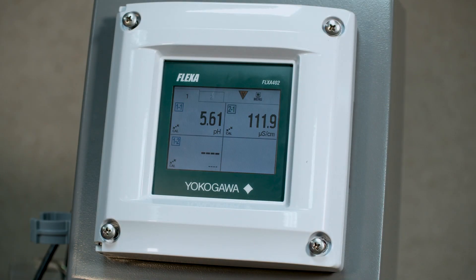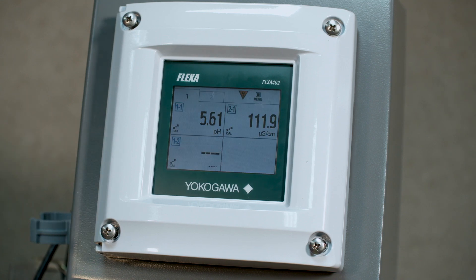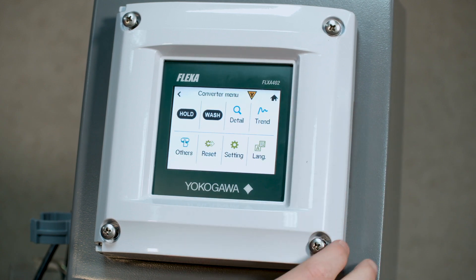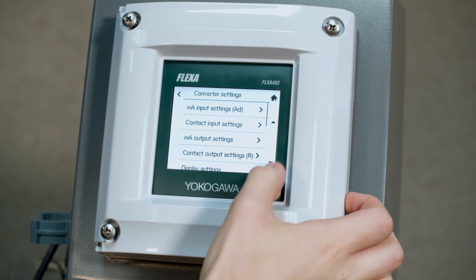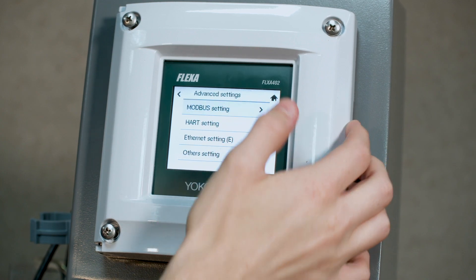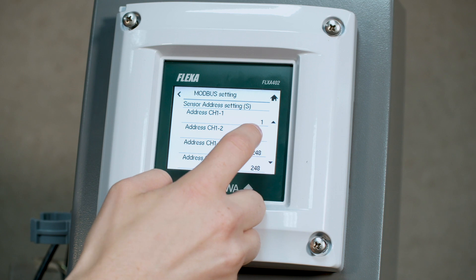Now that we have set our Modbus address to 2 for the SA11, we will plug the sensor back in. You'll notice even if you wait for a little while you will still get four dashes, because you need to go through and change a couple more settings in order to read in the sensor correctly. So first we are going to go to menu, setting, advanced settings, Modbus, and then go to the junction box, sensor 2.